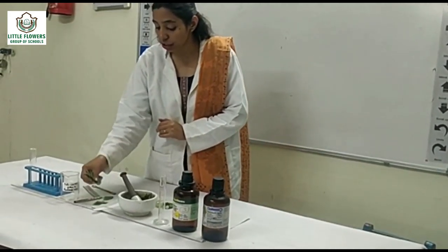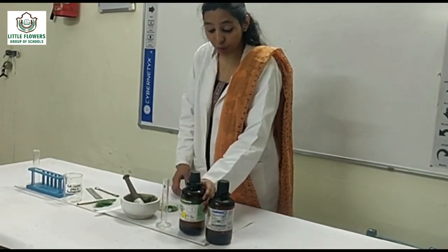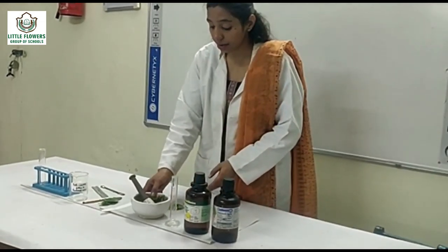The materials required for this are spinach leaves, petroleum ether, acetone, measuring cylinder, mortar and pestle.